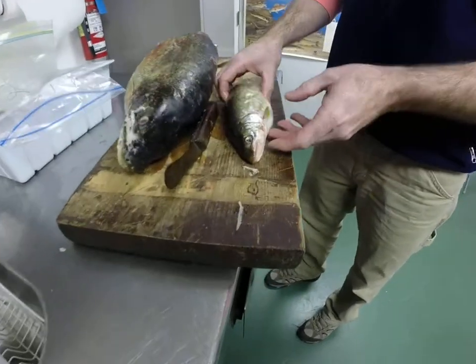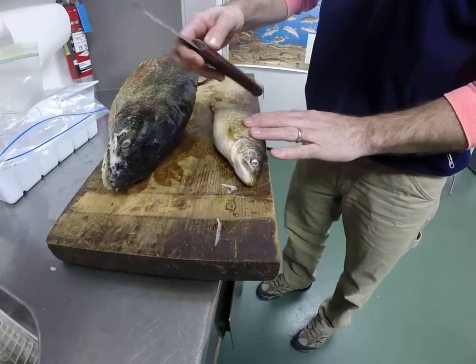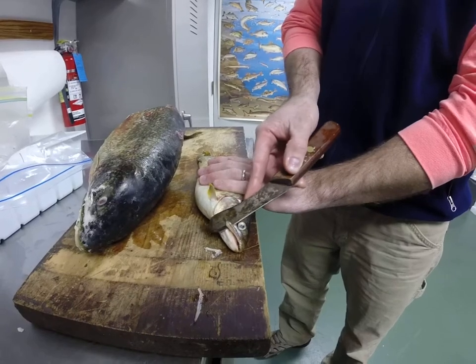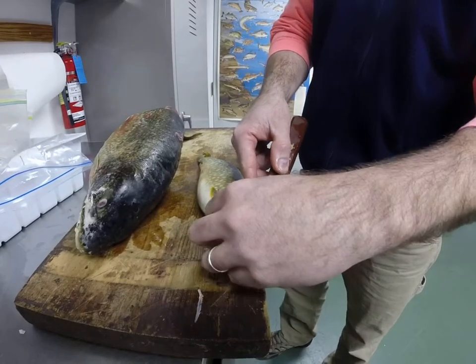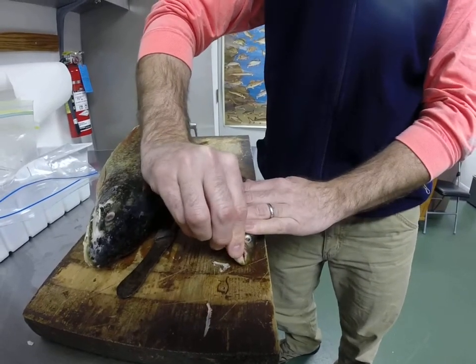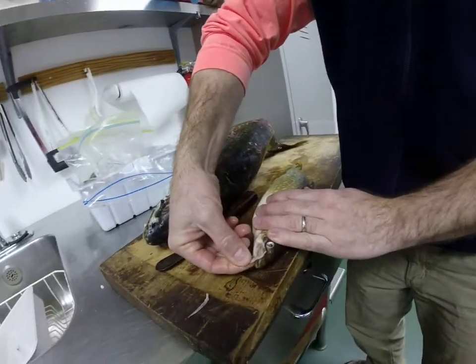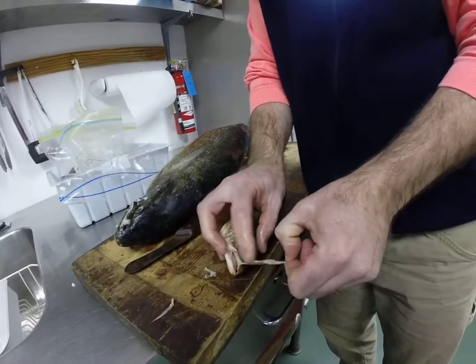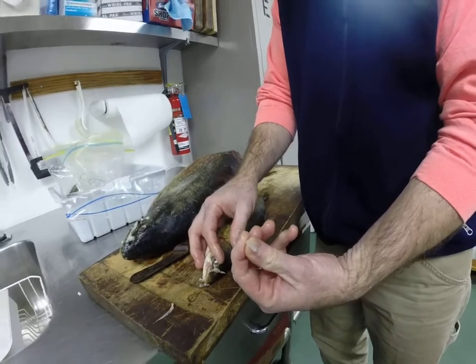That'll save you some time later during processing. Then it would go into a scale envelope and you're off and running. We'll grab another one and do the right side. Take the knife under the bone, cut the skin, and then essentially just peel it off. Fold it — pops out. Push it up, pull on it, skin stays behind. You have a clean maxillary.